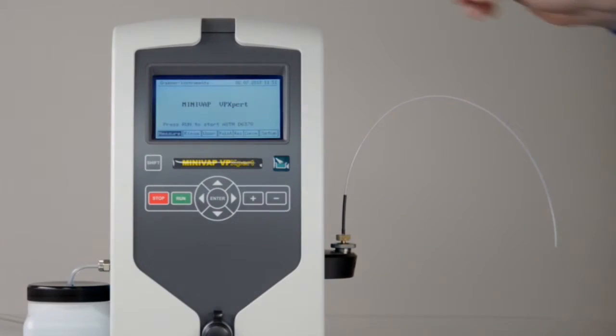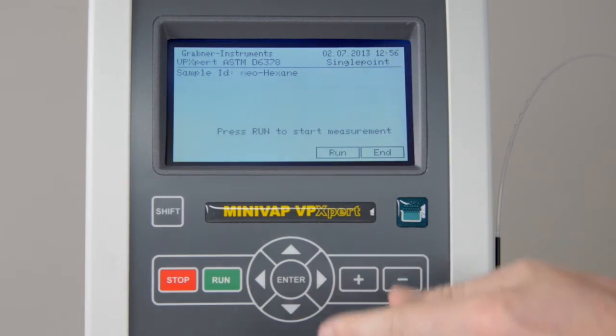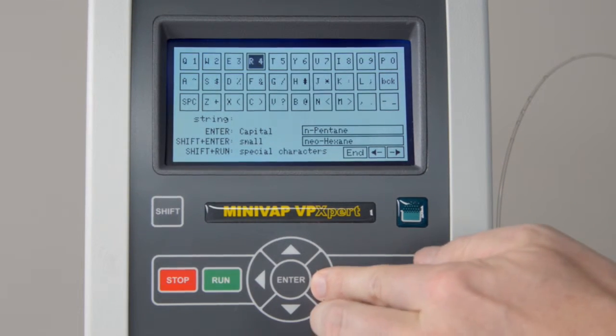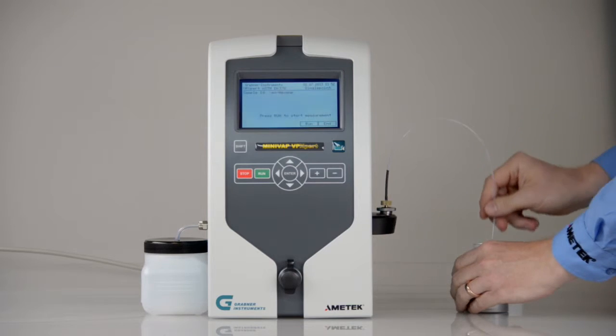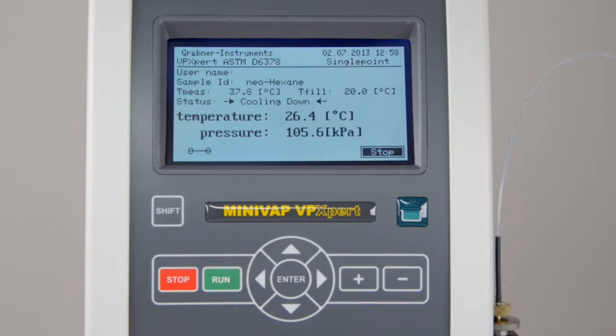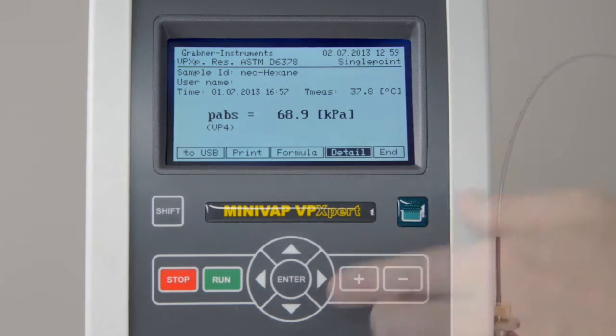To start the measurement, press Run. Define the sample ID. Press Enter to access the virtual keyboard to fill in the ID. Put the tube into the sample. Run the program. The VP Expert automatically starts with rinsing cycles to clean the measuring cell prior to the test. The result will appear directly after the test.